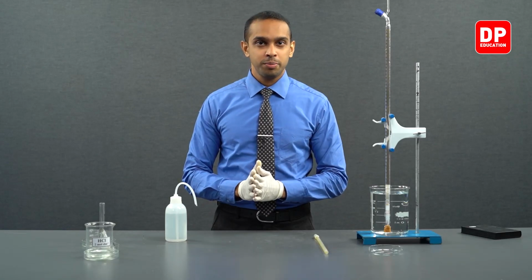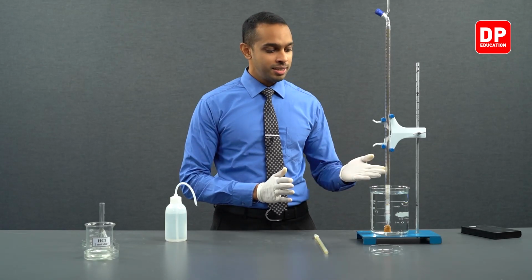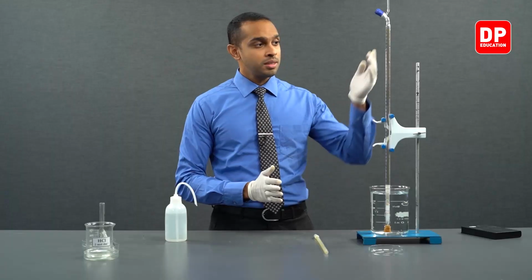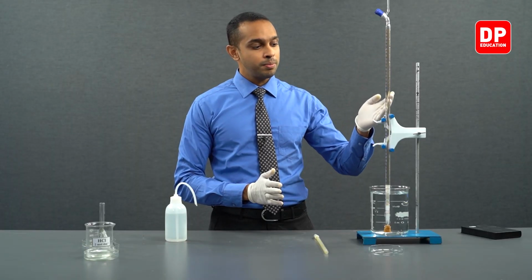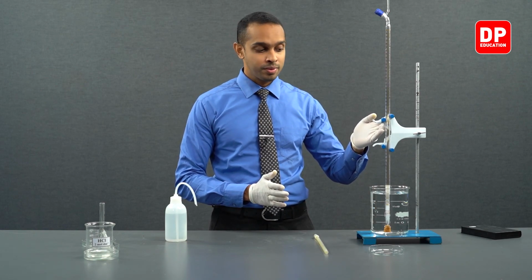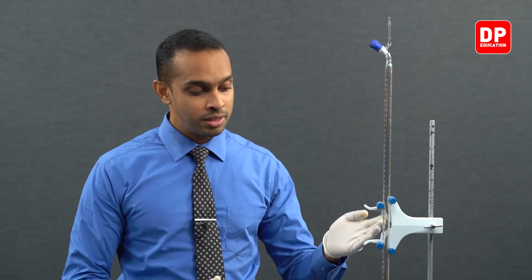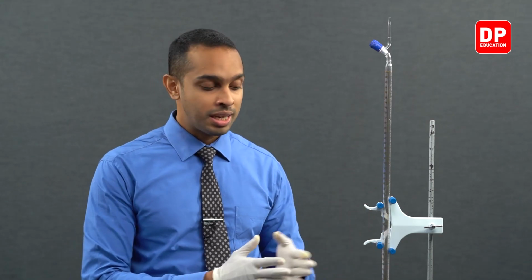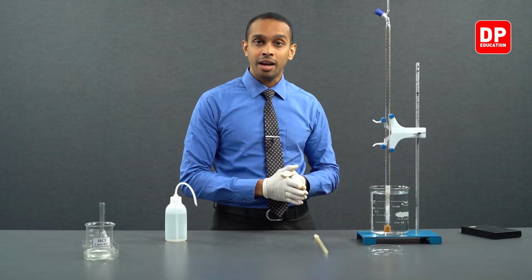It's been about 15 minutes now. As you can see, as the reaction continues to proceed, this area of our burette is getting filled with hydrogen gas. And as it gets filled, water is displaced downward. So we say this is a downward displacement of water method of collecting hydrogen gas.